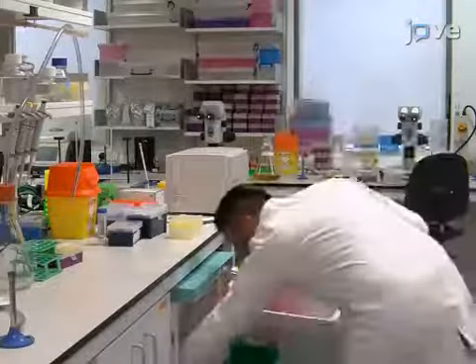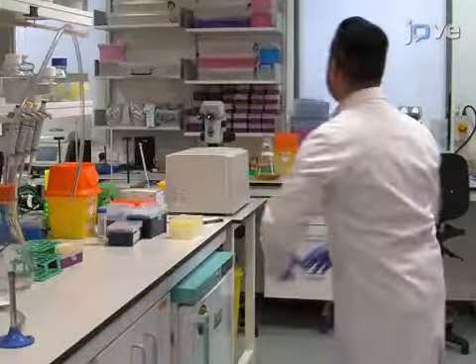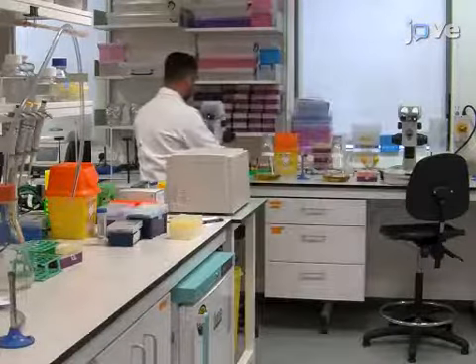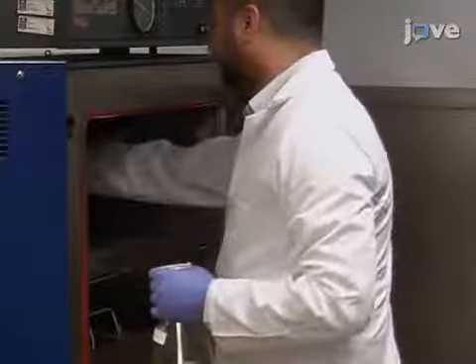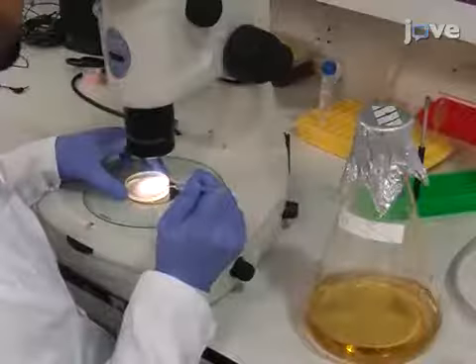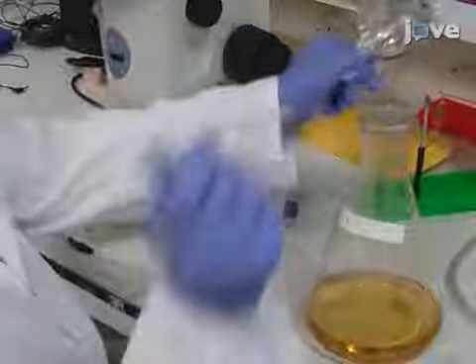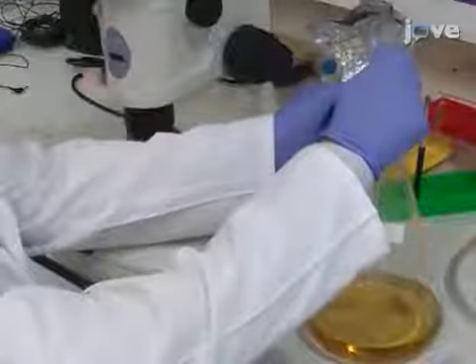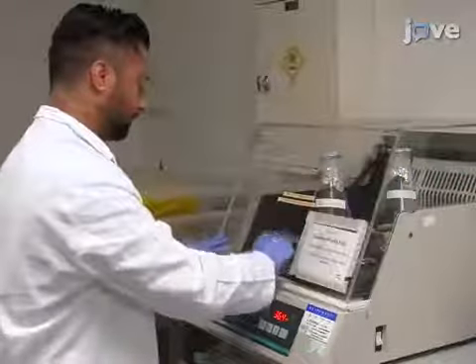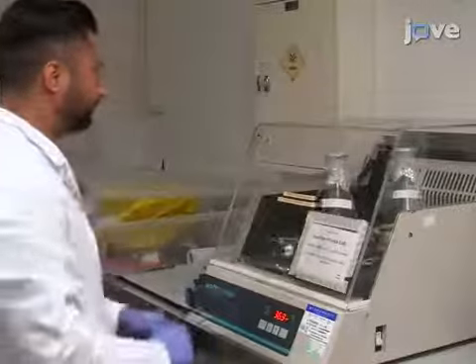After culturing OP50 on NGM plates according to the text protocol, prepare 500 milliliters of LB medium in each of 2-liter Erlenmeyer flasks and autoclave them. Inoculate each flask with a single colony of OP50 and grow the cultures at 37 degrees Celsius and 200 RPM for around 14 hours.